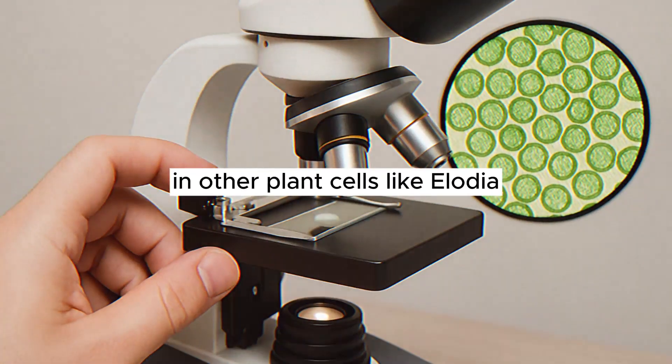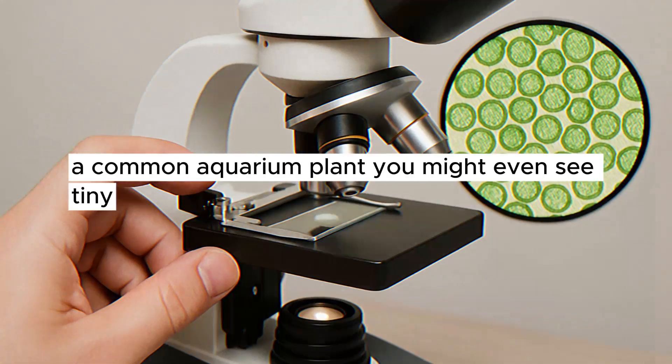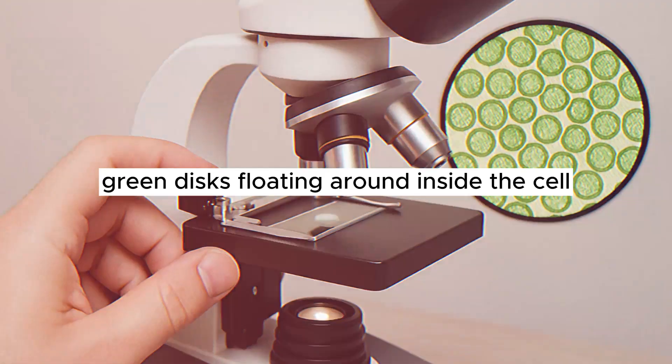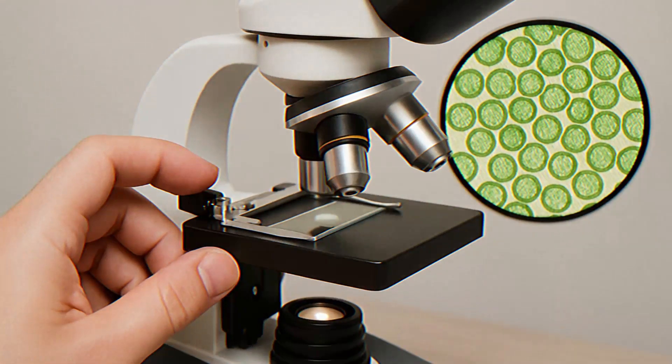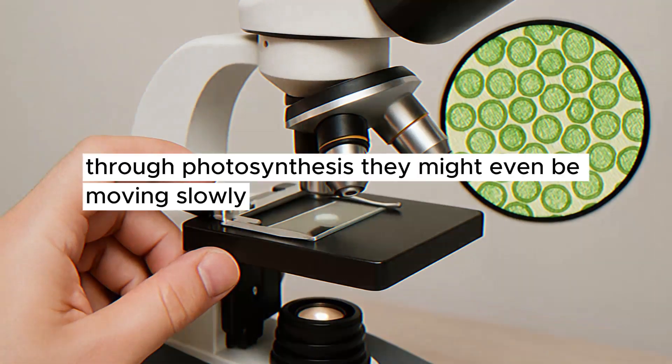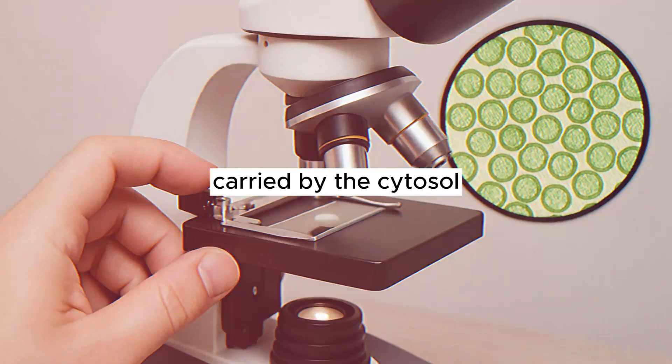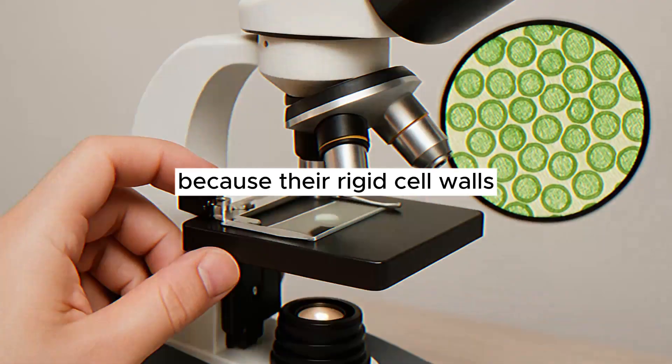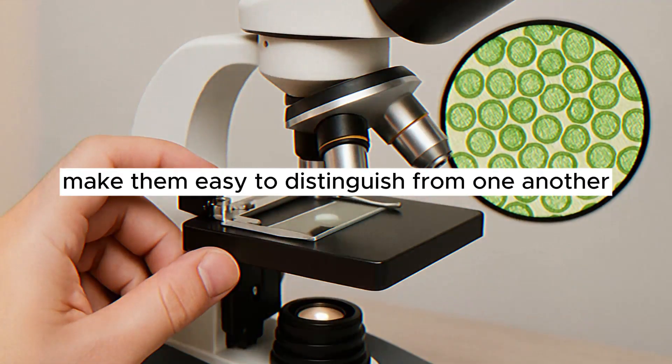Sometimes, in other plant cells like elodea, a common aquarium plant, you might even see tiny green disks floating around inside the cell. Those are chloroplasts, the amazing structures that capture sunlight to make food for the plant through photosynthesis. They might even be moving slowly, carried by the cytoplasm. Seeing plant cells is usually straightforward because their rigid cell walls make them easy to distinguish from one another.